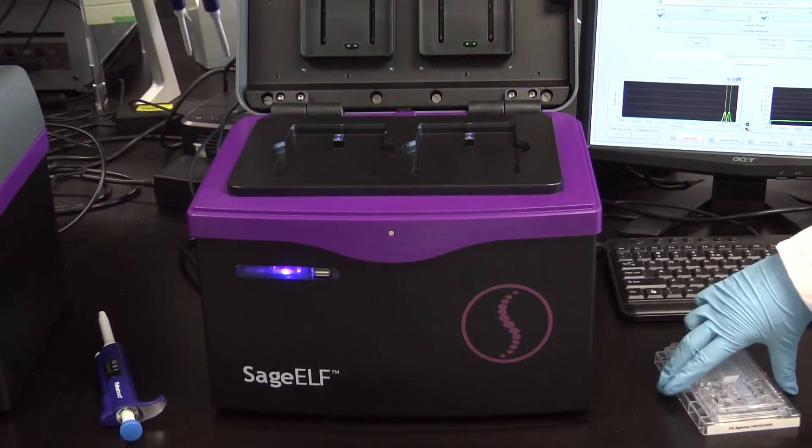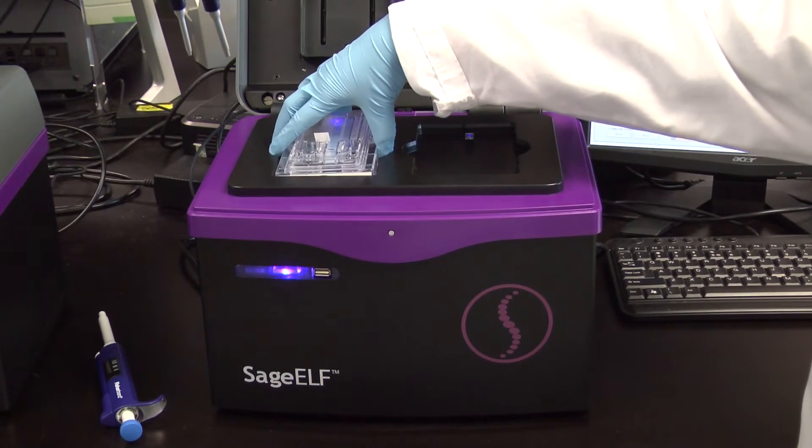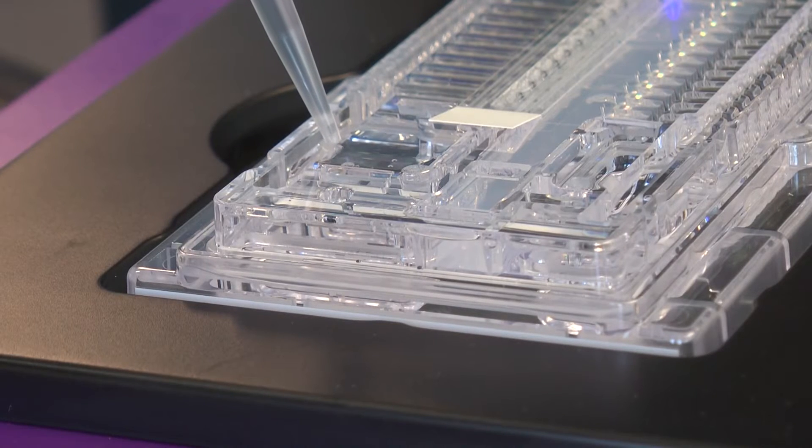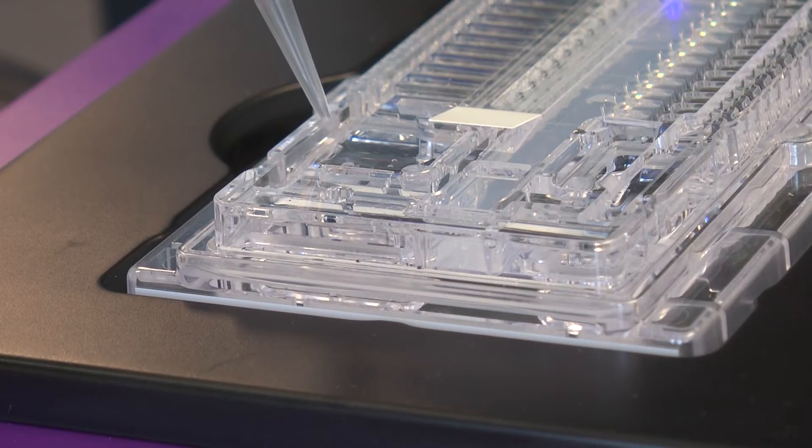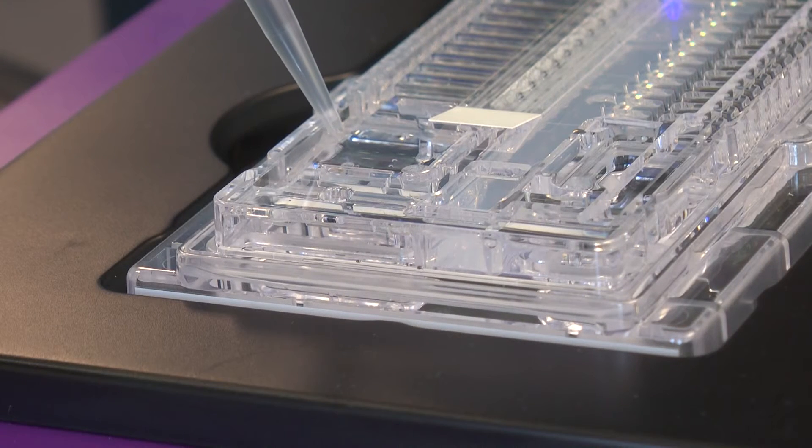Carefully move the cassette to the instrument nest while keeping it level. Top up the liquid level in the sample wells with fresh buffer. To ensure the correct current values, it is critical to fill the buffer completely up to the top of the cassette as shown here.